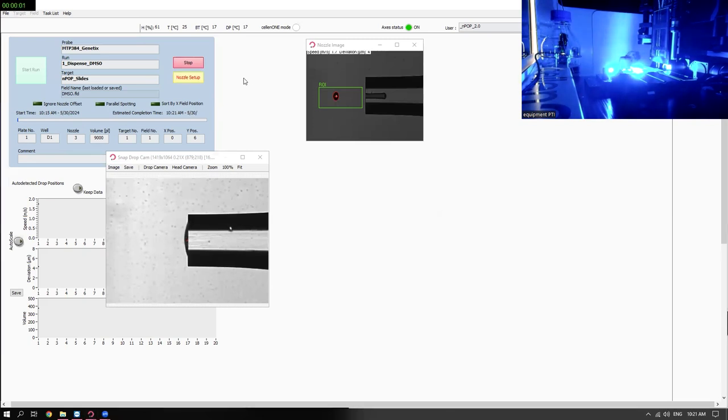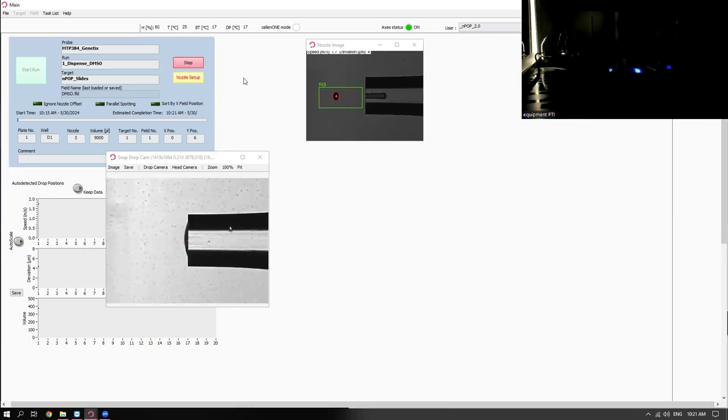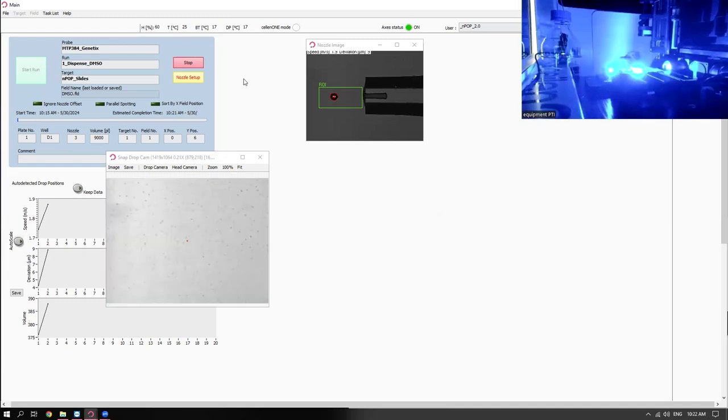So, question? So here we have our drop. The volume has been analyzed, about 387 picoliters. And now you can see it over here. It's starting to dispense onto the surface.